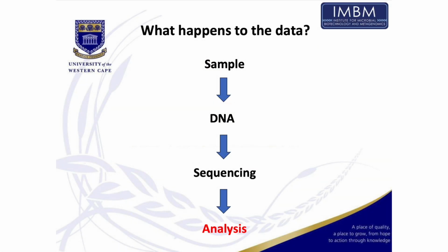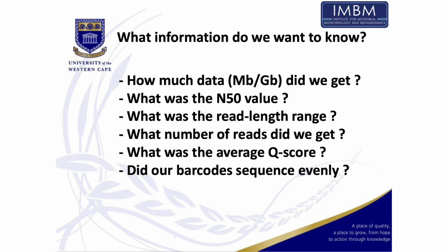Let's go sequencing. We've now done this sequencing, and the question was already asked, what do we do with the files once we get it? So, yeah, here's my very simple workflow, and we're at the last stage here. What do we do with the analysis? So naturally, some questions pop up, like, what information do we want to know about our sequencing run? One of the questions could be, how much data did we get? So we spoke about that earlier, and you can measure that in megabases.